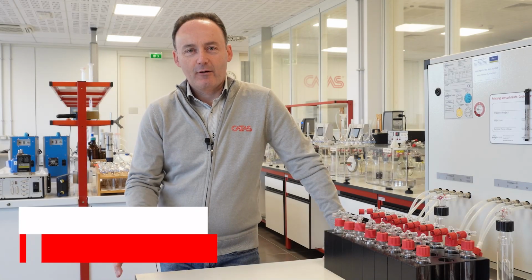Thank you to Franco Bulian for introducing the chemical department of Catas. As anticipated, what we do in this department is, in short, to perform two jobs. First of all, determination of formaldehyde content in timber panels that are used to make furniture that is then sold in Italy and internationally.